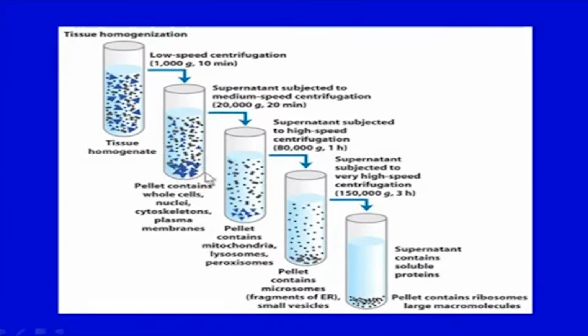Now, again like I said, this pellet is not completely pure or does not constitute only the largest ones, there will be smaller ones also. So, resuspending and recentrifugation a couple of times is required. Now, what is done? The pellet and supernatant are separated, and this supernatant is taken in a fresh tube and then centrifugation is performed again.